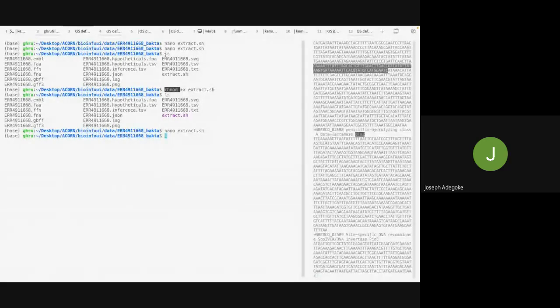Before, when I did ls, I saw the script as just one of the contents in this directory. By giving it permission to run on this computer, it gave it a different color. Okay, this is an executable script. But if I run this script here, it is going to fail.